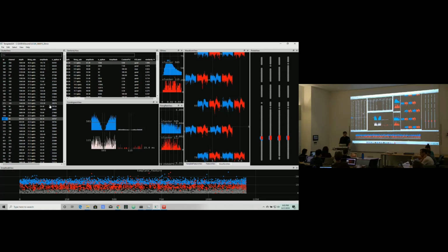I see. All right. Hopefully, that was partly because those merges had to happen, partly because neurons are drifting and they get split into different pieces when they drift. And those merges were supposed to try to merge them back together. So now we have many fewer of those examples because we're doing this drift tracking. And so the automated merges during the optimization now work a lot better. There were such merges even before in ks2 1. There was nothing they could do because of the drift. They just weren't effective. So now those things are a lot more effective, so it shouldn't be as much of a problem.